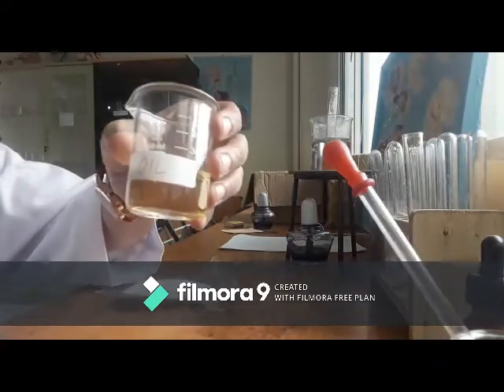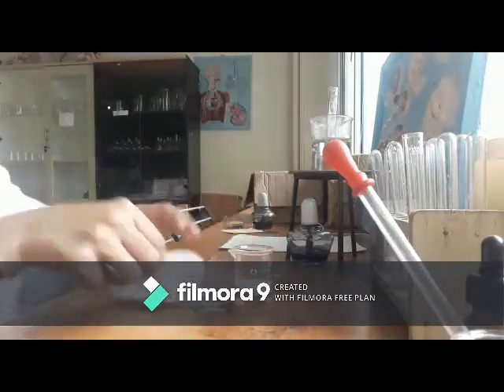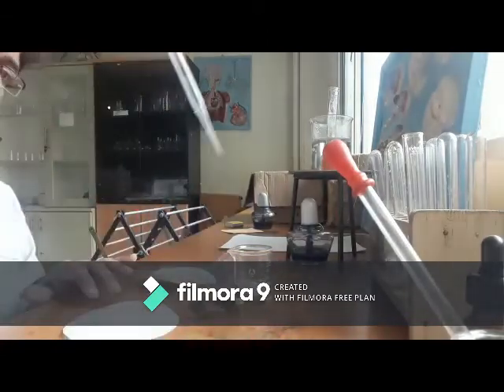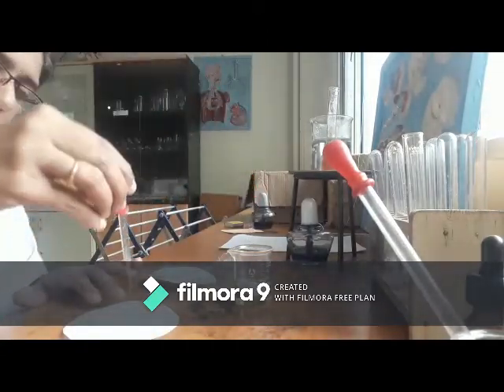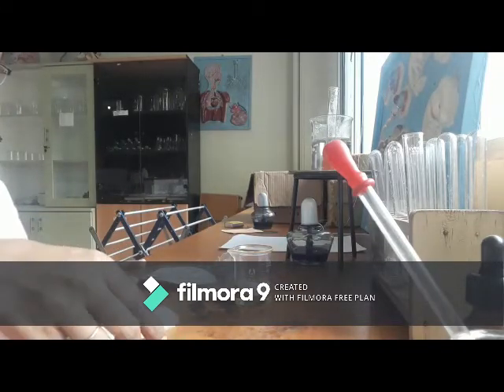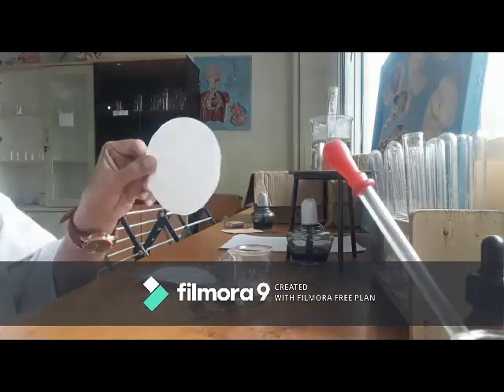The last is the lipid test. We use oil here and filter paper. Just add one drop of oil onto the paper and you can see the transparency, which shows the presence of fat.